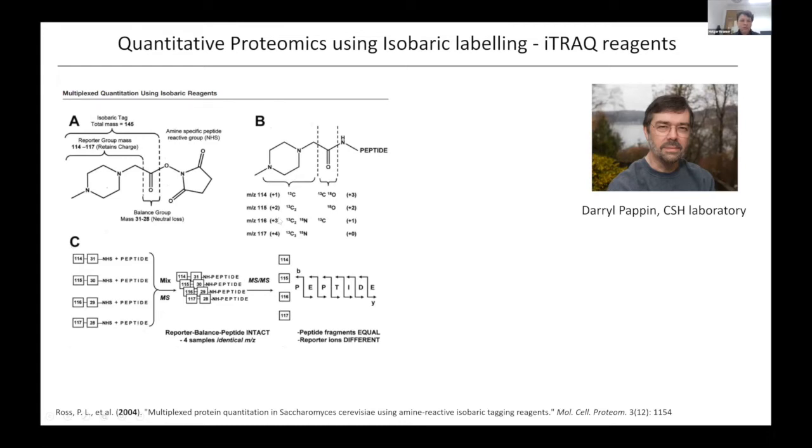And so what does that do when we then analyze this in the mass spectrometer? Essentially, the bond between the carbonyl group and this ring structure here is broken, and we liberate these reporter ions. That means under MS/MS fragmentation conditions, we are then able to see 4 peaks at 114, 115, 116, and 117 Daltons. And that is shown over here.